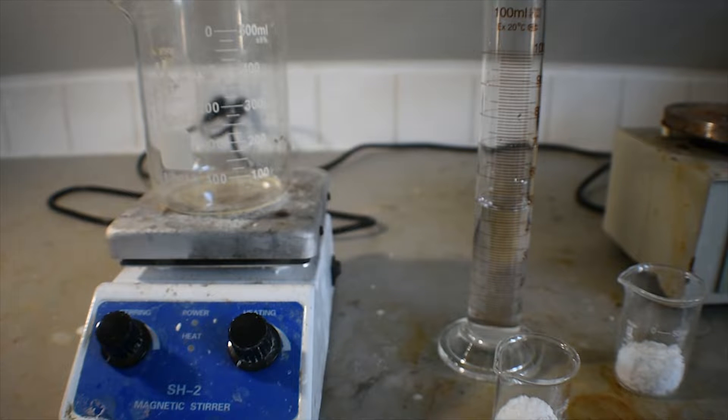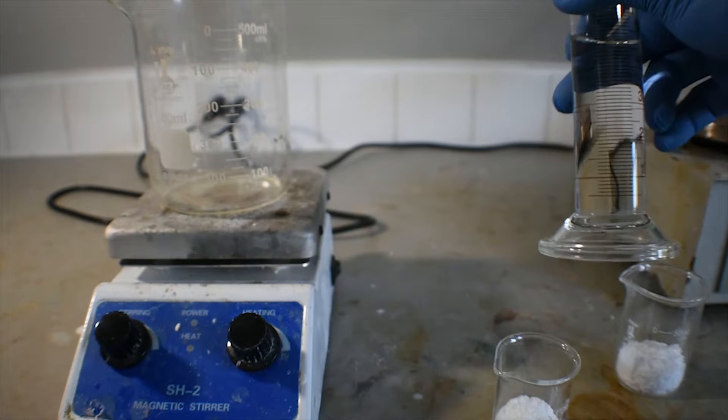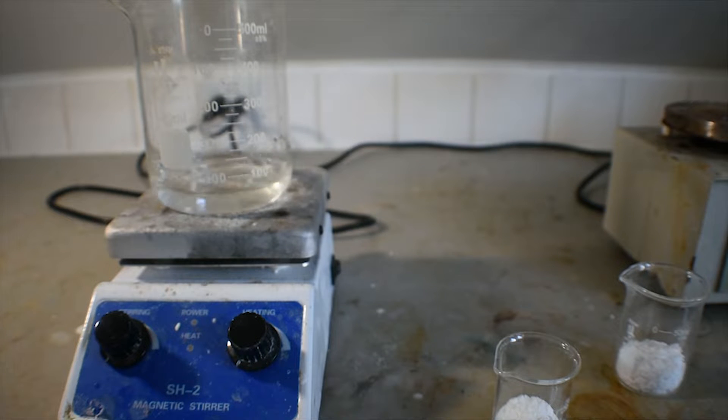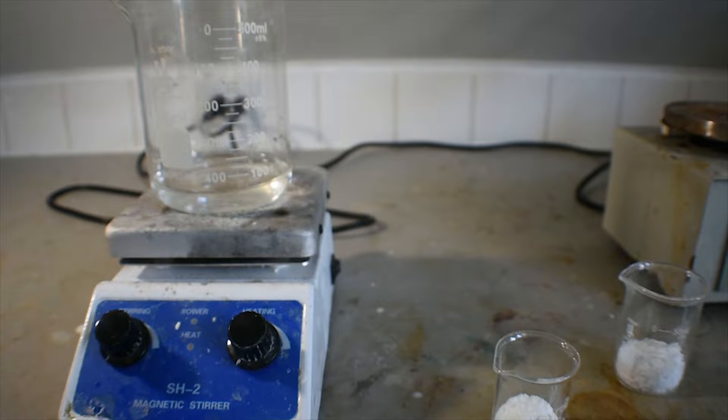First, I've weighed out 50 milliliters of distilled water in this graduated cylinder, and I'm going to add it to this 500 milliliter beaker on the hot plate stirrer. Now that that's been added, I'm going to put a stir bar in there.